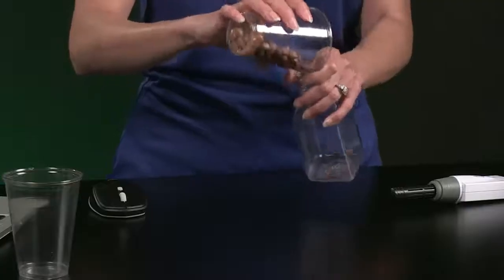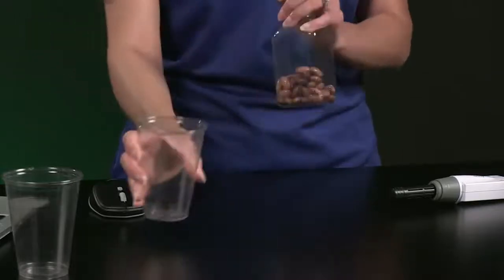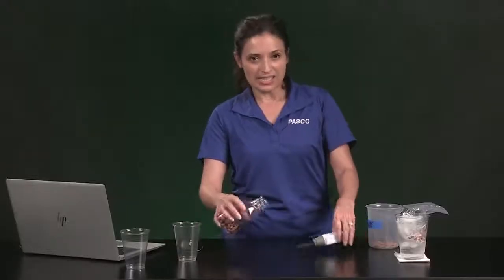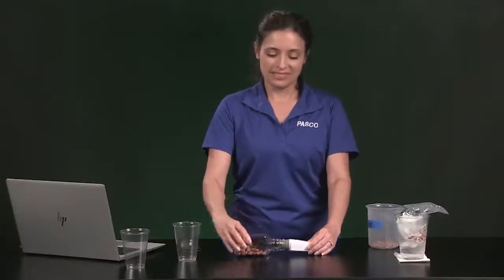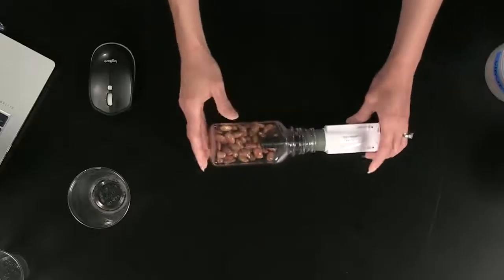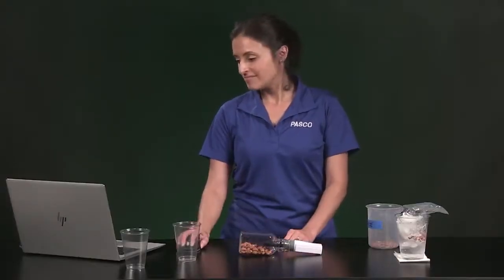Let's add about 25 milliliters of room temperature germinating seeds. The mass of this sample is 43.01 grams. Carefully add the sensor and keep it from getting wet. Now we will collect data for 5 minutes.